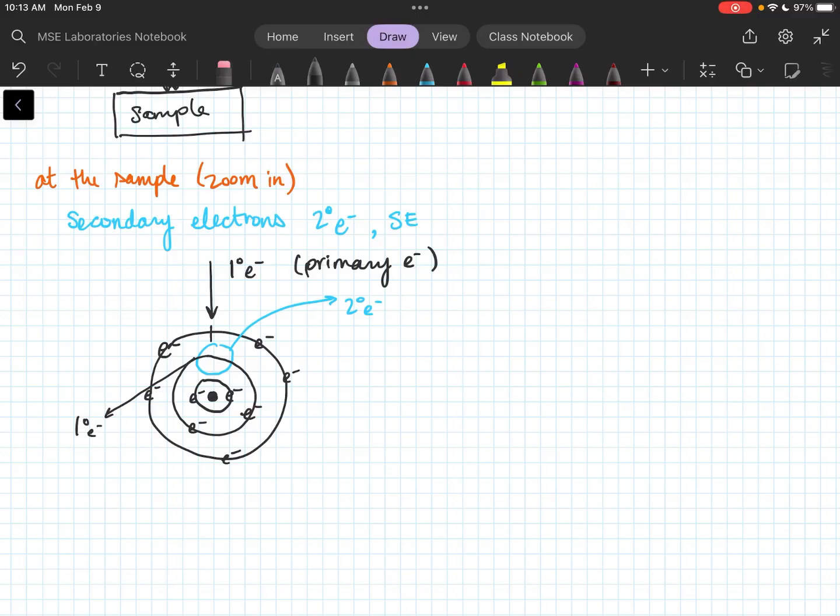So I've got the secondary electron drawn as this curvy line because it kind of falls out. It's not a particularly high energy system, whereas the primary electron can keep going and run into multiple other atoms and create a bunch of other secondary electrons. So now it might kick out another secondary over here, and then down here it's going to kick out another. So that same primary electron can kick out several secondary electrons from the same material. That makes sense.